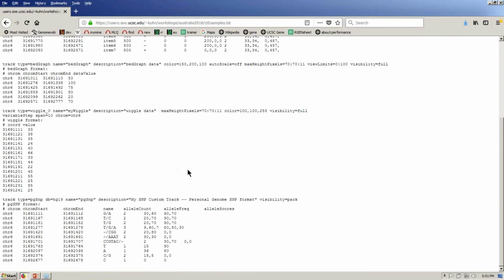you can load the data into the variant annotation integrator. Here's the data format. It's a modified bed file. The name here has to show the two alleles. The number of alleles has to be shown, and although actually the number of alleles can be 0, and then over here you have to have zeros in these columns. If you have 3 alleles, then the number will be 3, and then your read depth can be shown up here in this allele frequency column here. Here was the 60,90 that we saw earlier, and you have to have a comma delimited data field here that matches the number in the data field next to it.